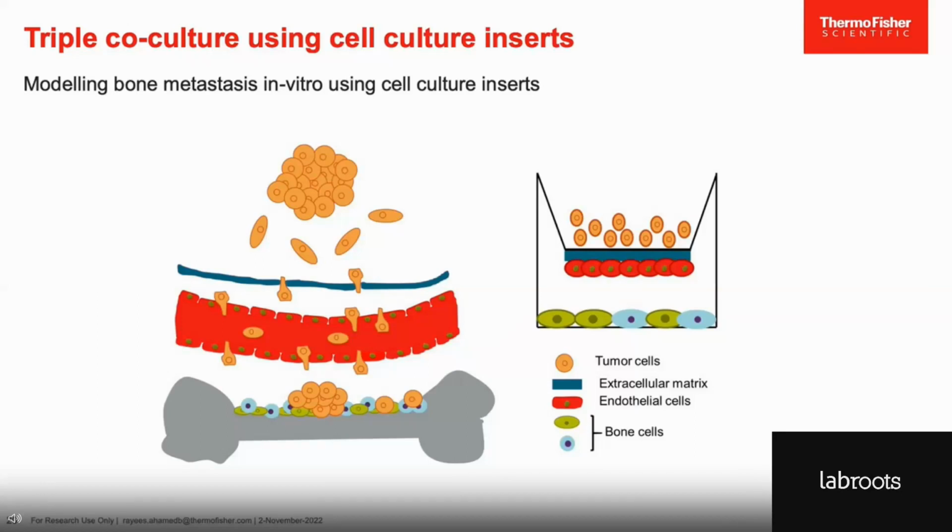The tumor cells actually invade the ECM barrier at the tissues and interact with the endothelial cells, which leads to the transendothelial migration of these cells, thereby metastasizing to the osteocytes at the bone. So we try to mimic this system using our cell culture inserts.